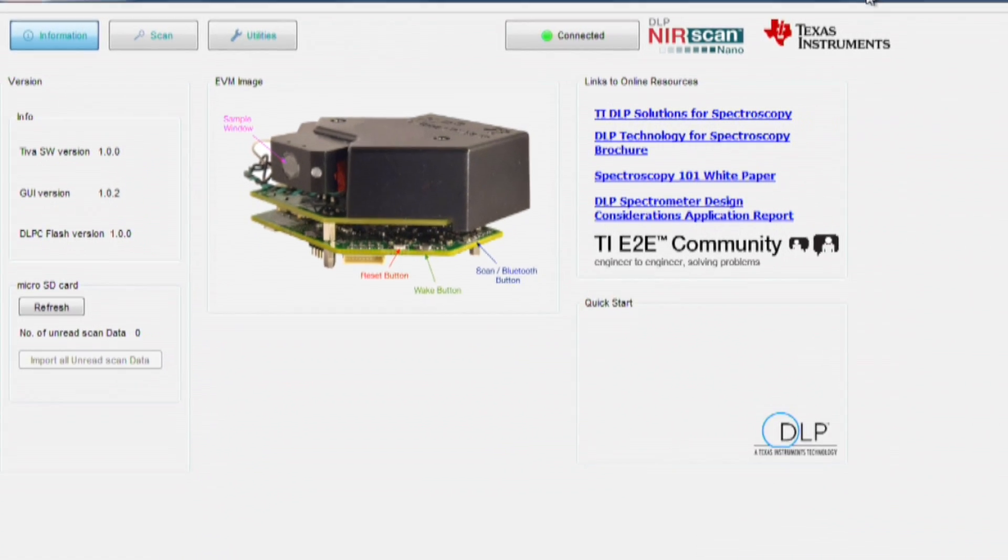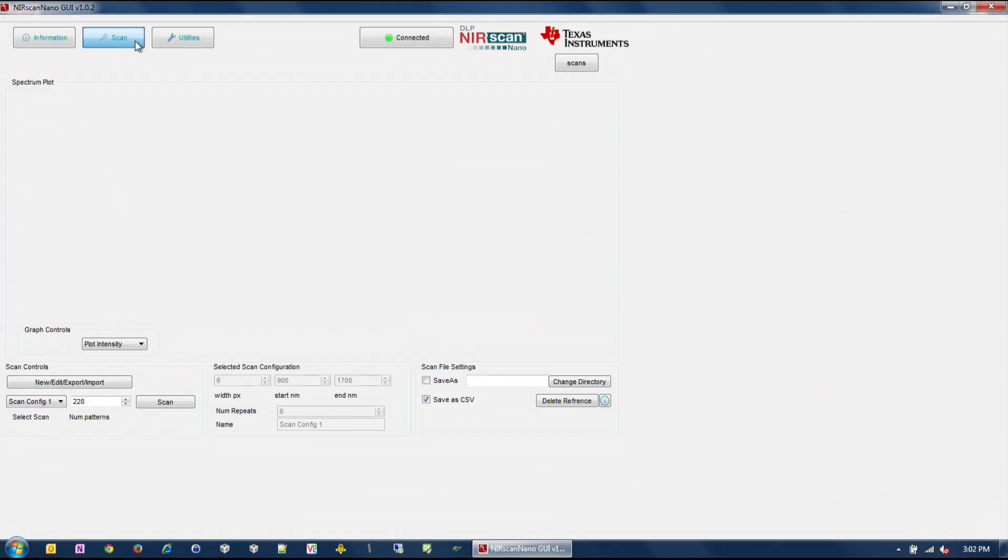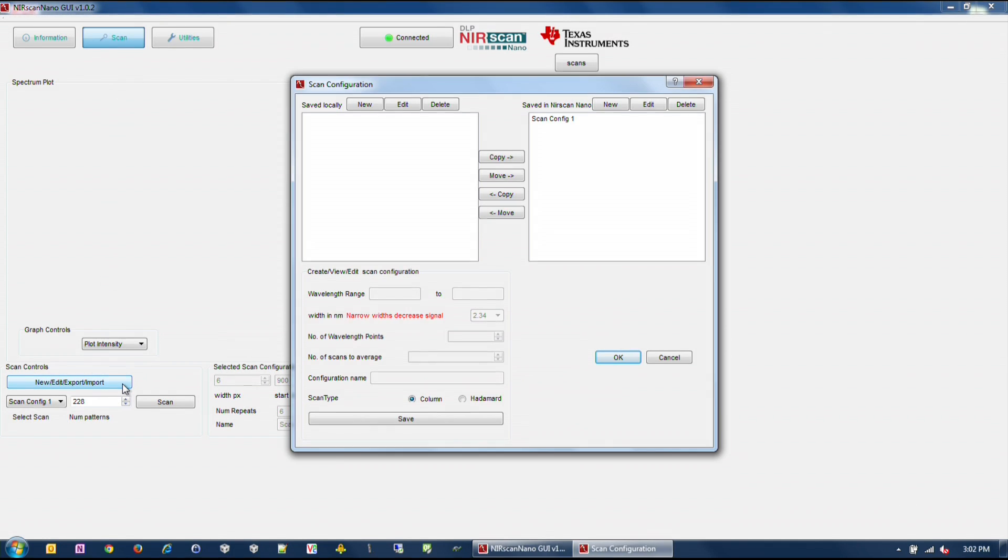To take a scan, a scan configuration must be created first. A scan configuration specifies parameters of a scan including wavelength range, number of patterns, number of scans to average, and smallest desired spectral resolution width in nanometers.